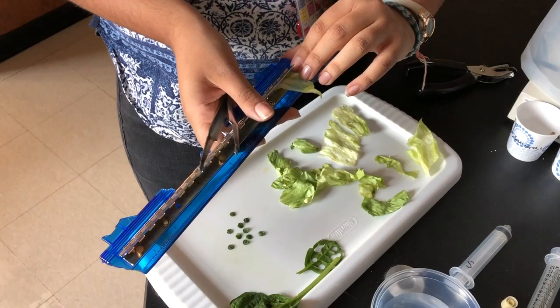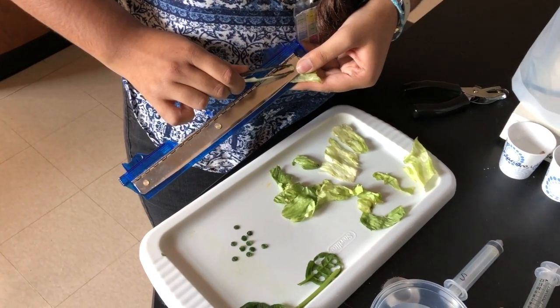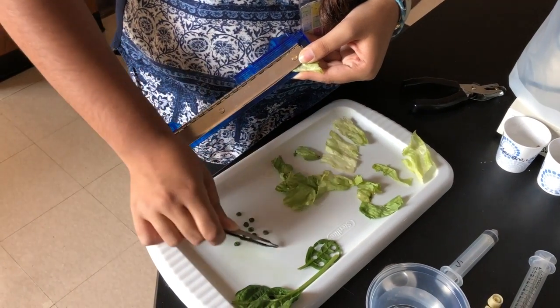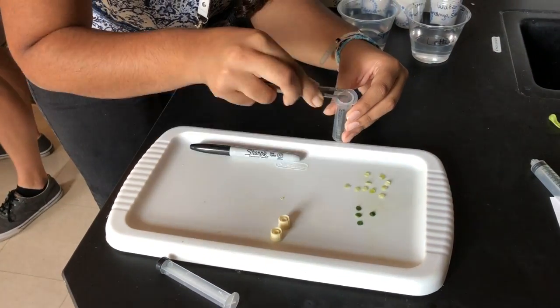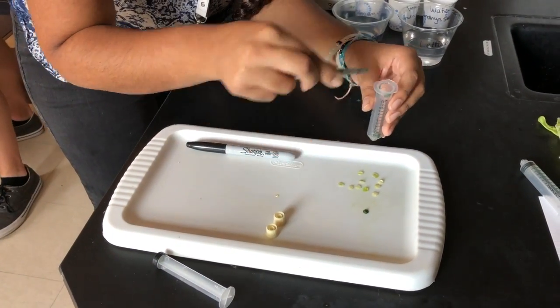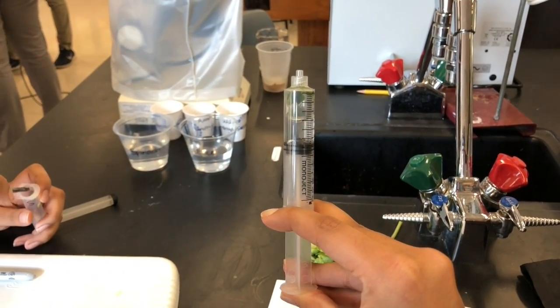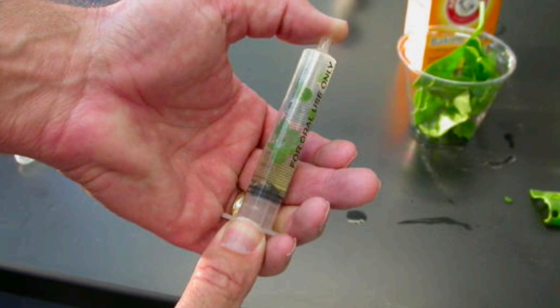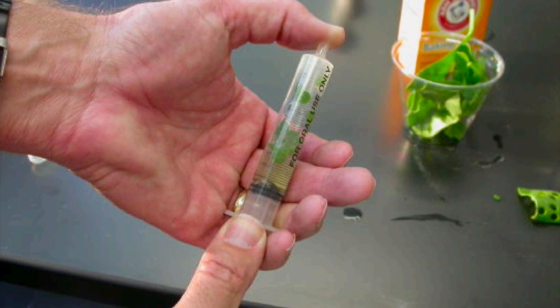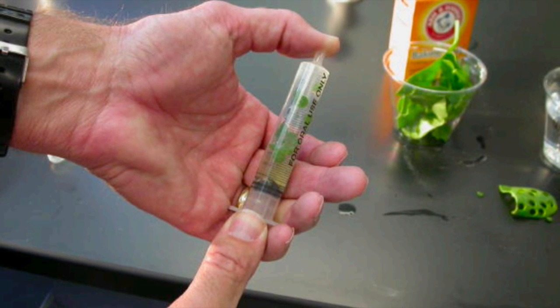Step 4. Using a single hole punch, cut out 5 leaf discs from both spinach and lettuce. Step 5. Place the leaf discs into appropriate syringes and add a small amount of sodium bicarbonate solution to each. Step 6. Place the cap on the syringe and then draw back to create a vacuum, and swirl to keep leaf discs suspended in the solution.